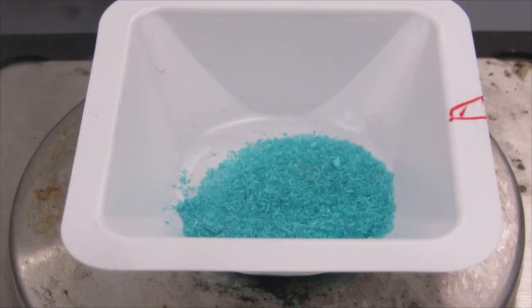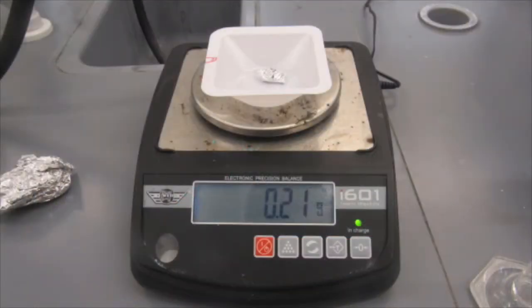To the copper chloride, we're going to add a little bit of aluminum in the form of aluminum foil. You'll need about 0.2 grams to do this experiment.